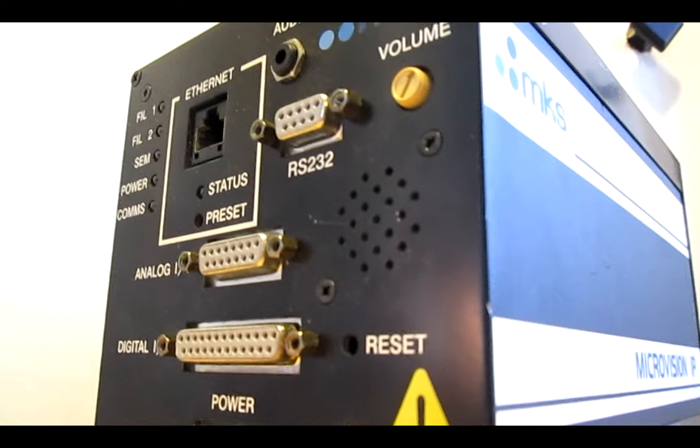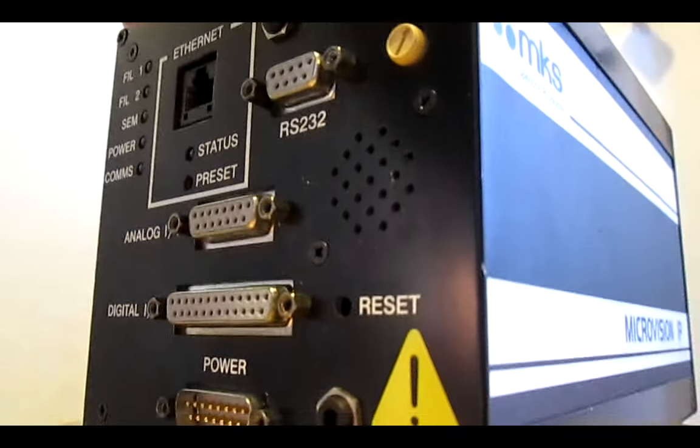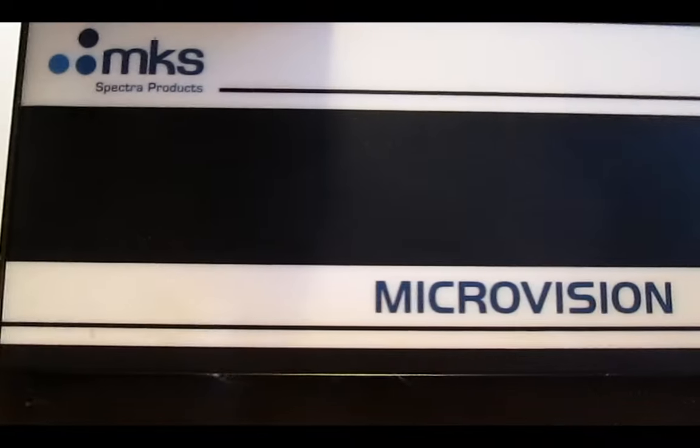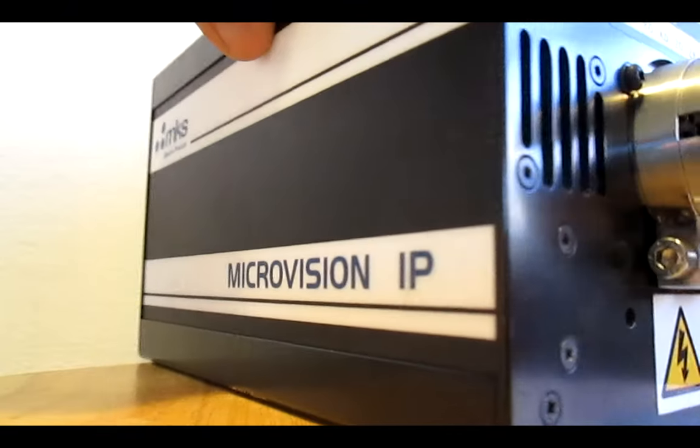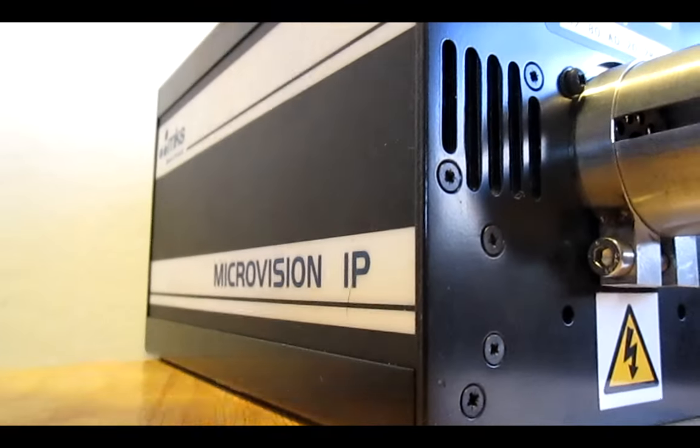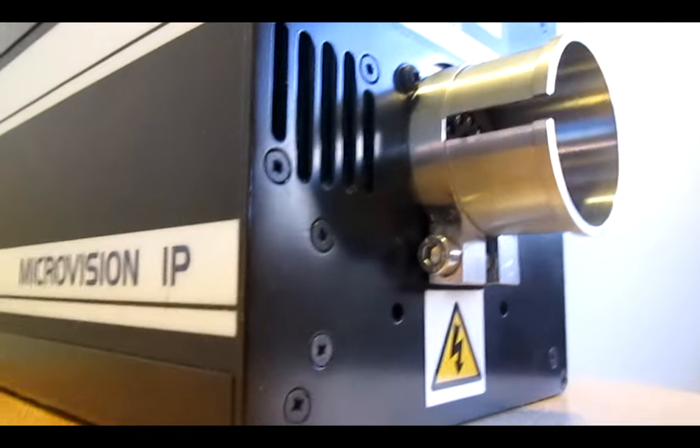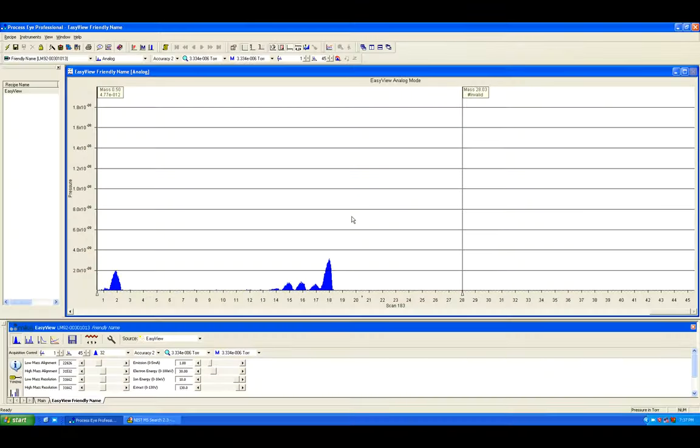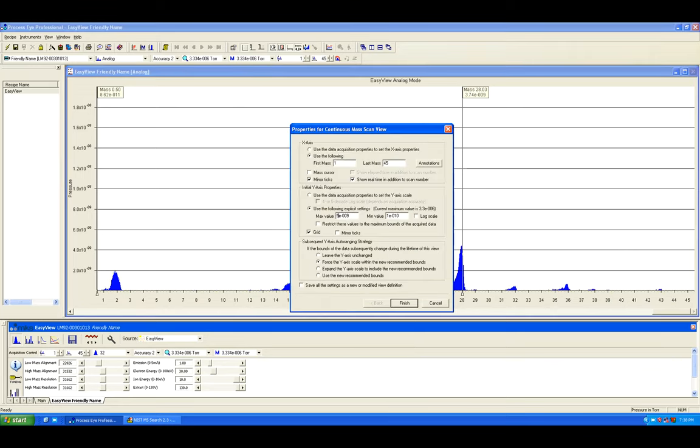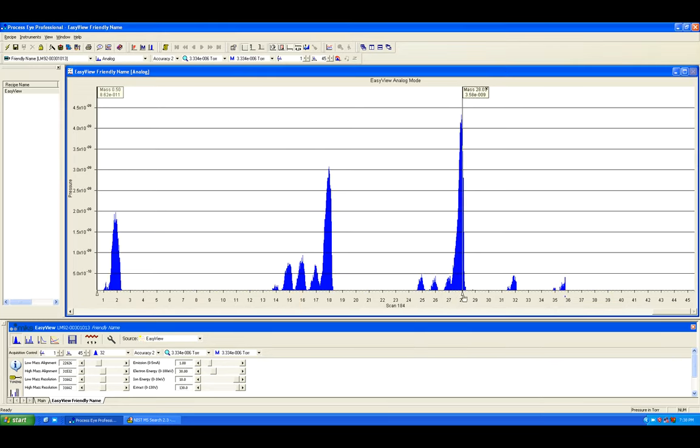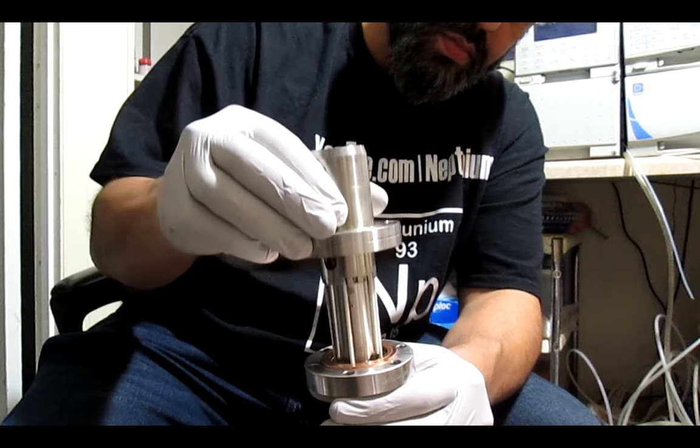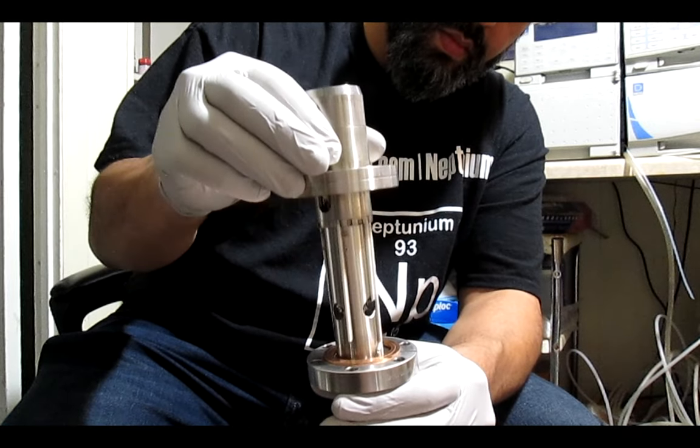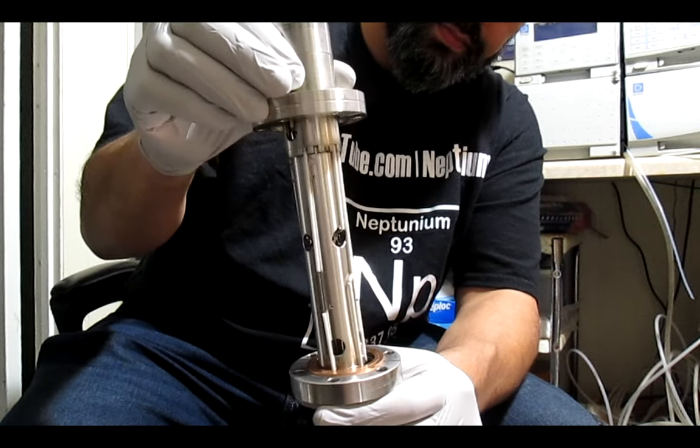The RGA is a Microvision from MKS. This model is already over 20 years old but works just fine. There's many tunable settings to adjust on the software, and it can be hacked to explore up to 300 AMU depending on your quadrupole and sensor size.